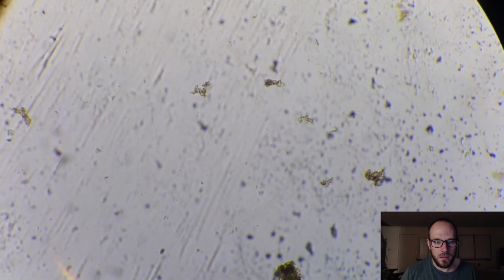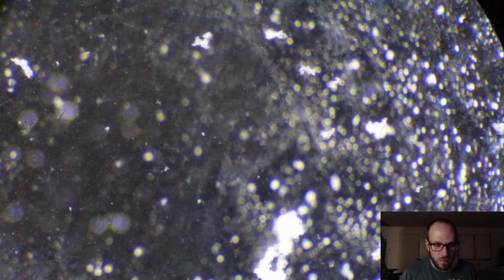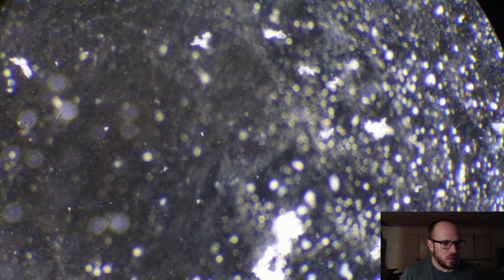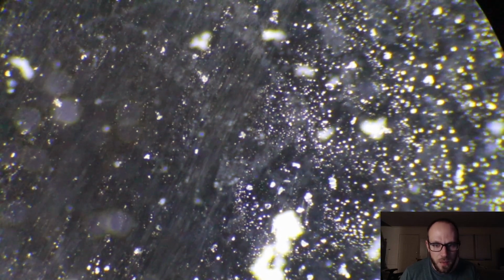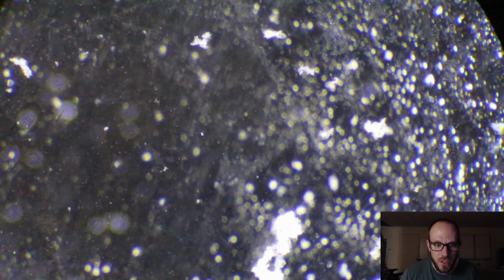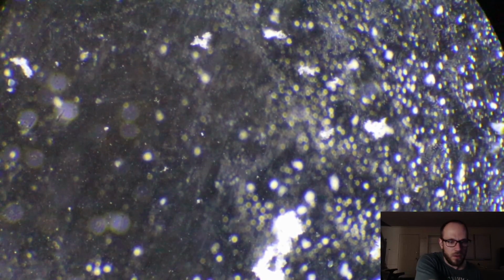Not as many as there were before, though. Back to Darkfield, I think. One second. Let's max this light out. And work on the focus. Yeah, it's tougher with the focus. See, this is the top of the slide. This is the cover slip, which admittedly is a little dirty. I should have probably used a new one, but shoulda, woulda, coulda, right?